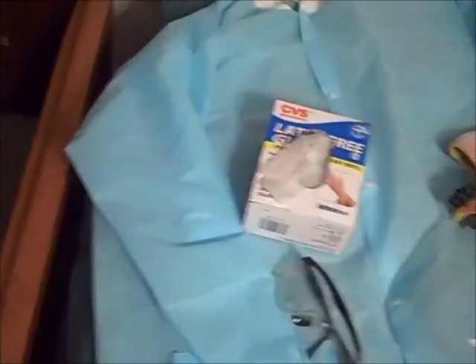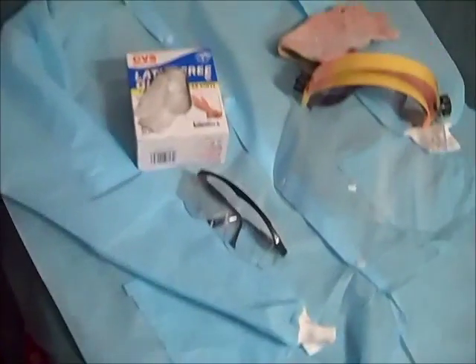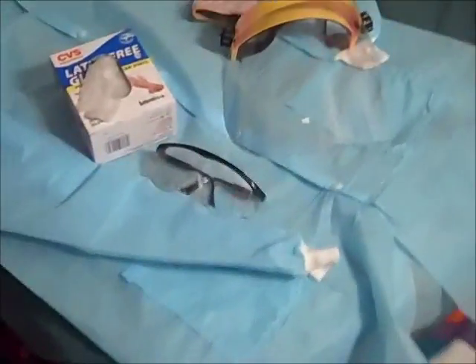Also, it is worth noting that whenever you are doing any lab work, you should wear jeans or some coverall pants that will protect you, and also closed-toed shoes. If you have all of this stuff, then you are pretty well protected. Do not cheap out on your safety. It should go without saying, but I will say it anyway: do not emit toxic or corrosive vapors into your living space. I take several steps to prevent this. Whenever I am doing an experiment, this door is closed, this fan is on, and this window is open. That generally gets rid of some of the vapors that enter my workspace. I can use hydrochloric and acetic acid indoors, but for those experiments where I am expecting to produce a lot of nitrogen dioxide or chlorine gas, I have an outdoor table set up so I can stand away from it and avoid breathing this stuff in.